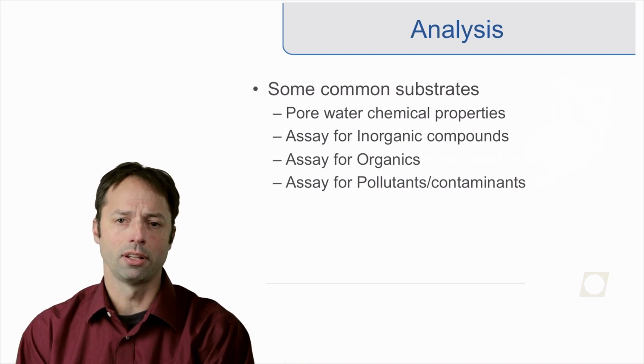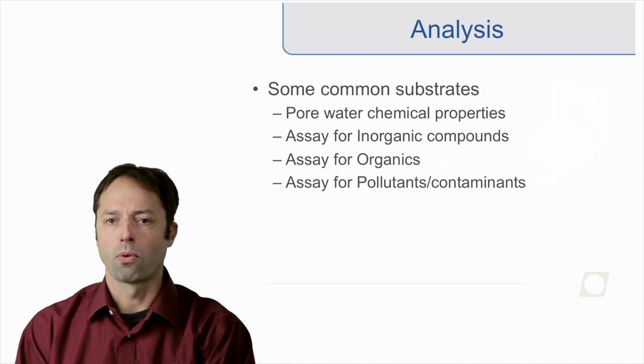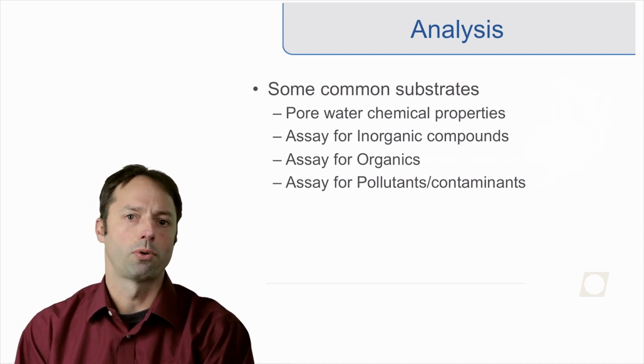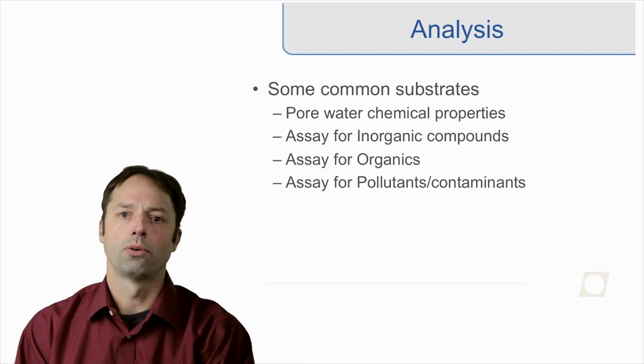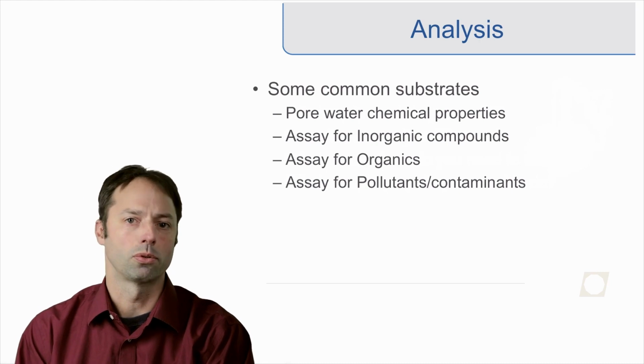There are some common analyses that are done. Are you looking at pore water chemical properties? Inorganic compounds, there are assays for organics, and also more complex pollutants or contaminants from, say, landfills or waste sites.